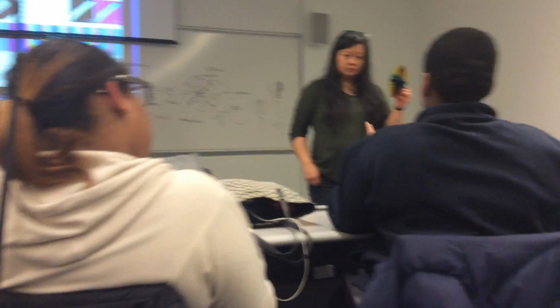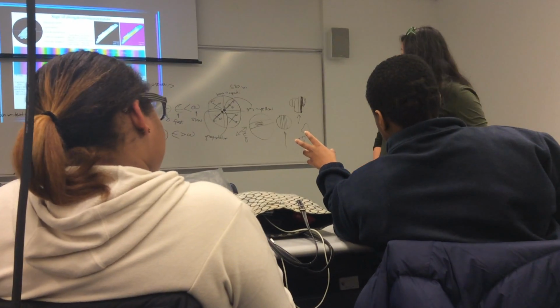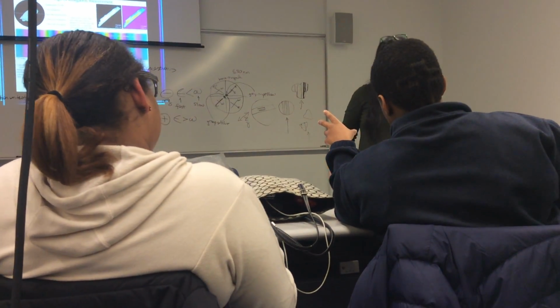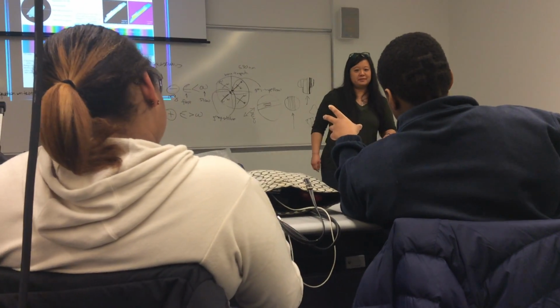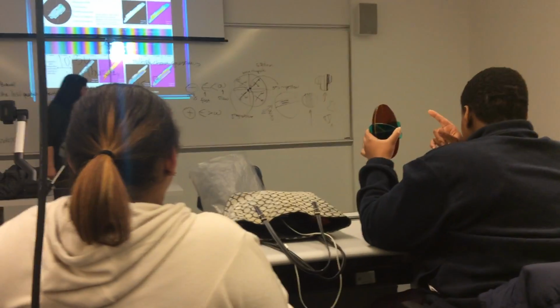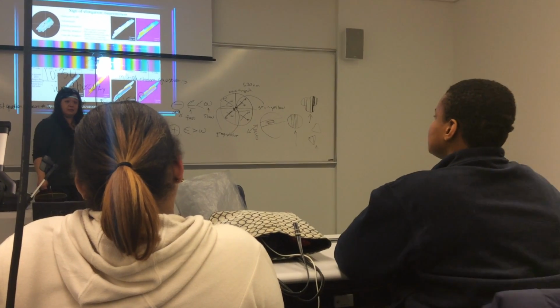So, if I'm correct here. The image for that, if you were to draw it, what would you call that figure that you drew there? That is a centered biaxial interference figure viewed conoscopically. Okay. So that would look different for this, because for this, alpha would be going through, not beta? No, hold on a second. I have not defined whether this is a positive or negative optic sign yet.